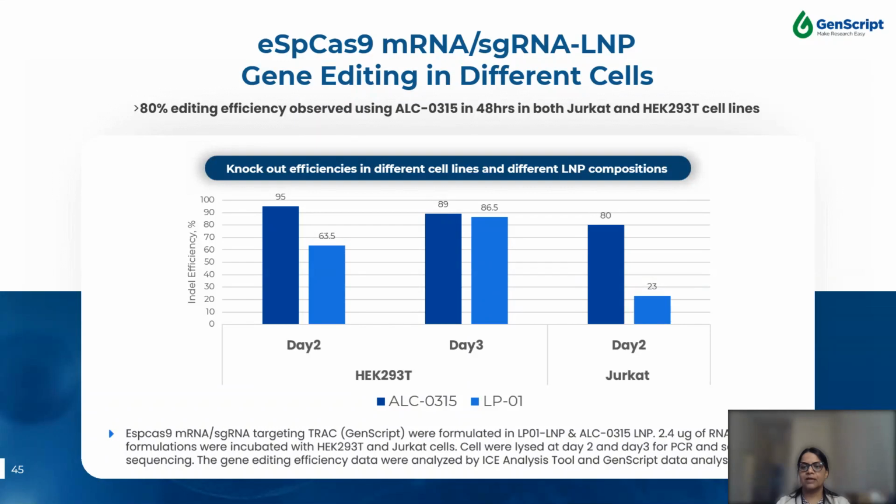And cells were lysed at day 2 and day 3 for PCR and Sanger sequencing, and the gene editing efficiency data were analyzed using the ICE analyzer tool and GenScript software.